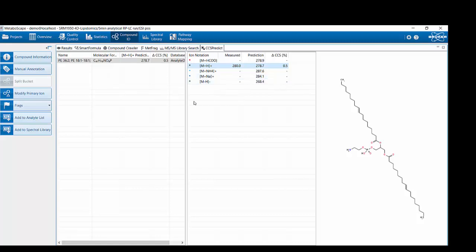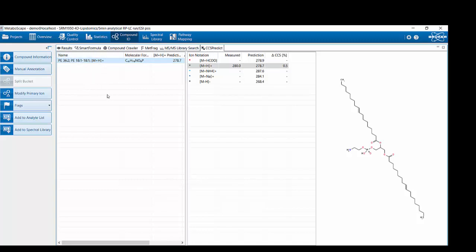With this I hope I could show you how accurate CCS values can help increase confidence in lipid identification. To be sure about the specific lipid species and which fatty acids are combined, I will highlight this in a further short video, because MetaboScape enables combining spectra acquired in positive and negative mode — and combining both is how you can really pinpoint the lipid classes.